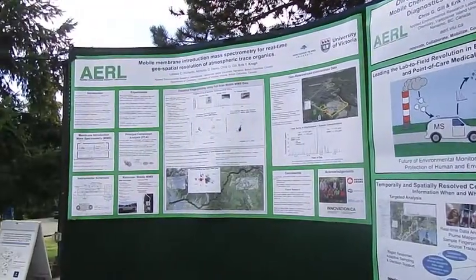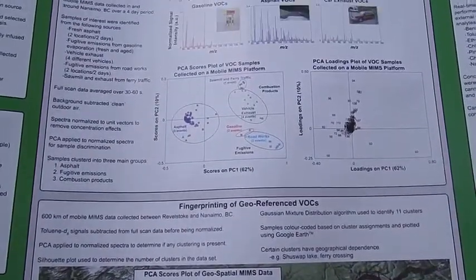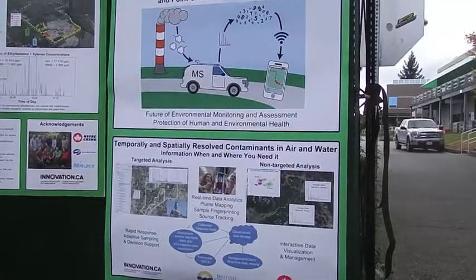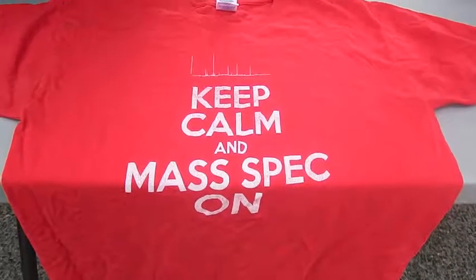The vehicle is outfitted with a variety of conventional air quality sensors that allow us to make measurements of things like greenhouse gases, carbon dioxide and methane primarily, as well as other types of pollutants that are impactful to human health. So again, all that data is streaming together simultaneously. Those measurements allow us to put all that information into one package so that we can then get an idea of how much is there and what it is.